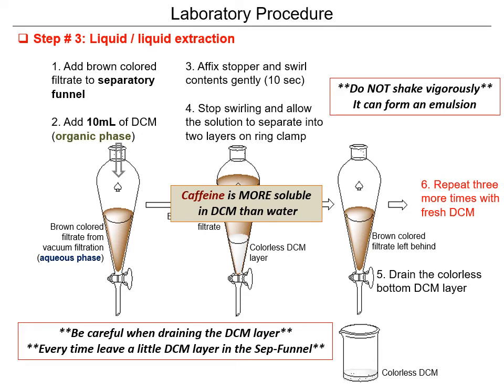After 4 liquid-liquid extractions, all of your caffeine will have been extracted from the aqueous phase into the DCM organic phase, since caffeine is more soluble in DCM than water.